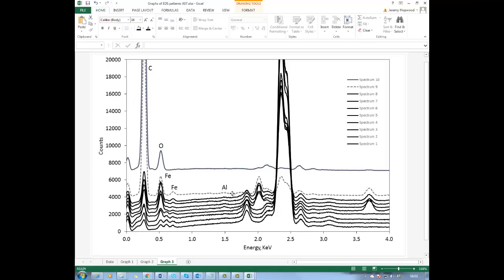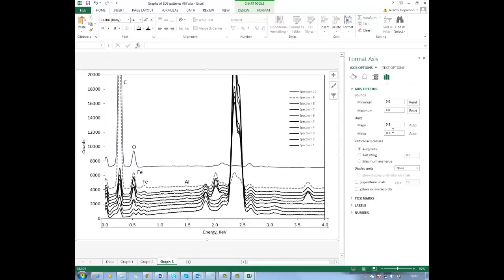Just that. Then I've got a peak here, this is the lead peak. What would be helpful is on the tick marks, because I didn't adjust the tick marks, I'll put those going up. Minor ones, tick marks, I'll put them outside so I can see where everything is. For minor it's 1000.